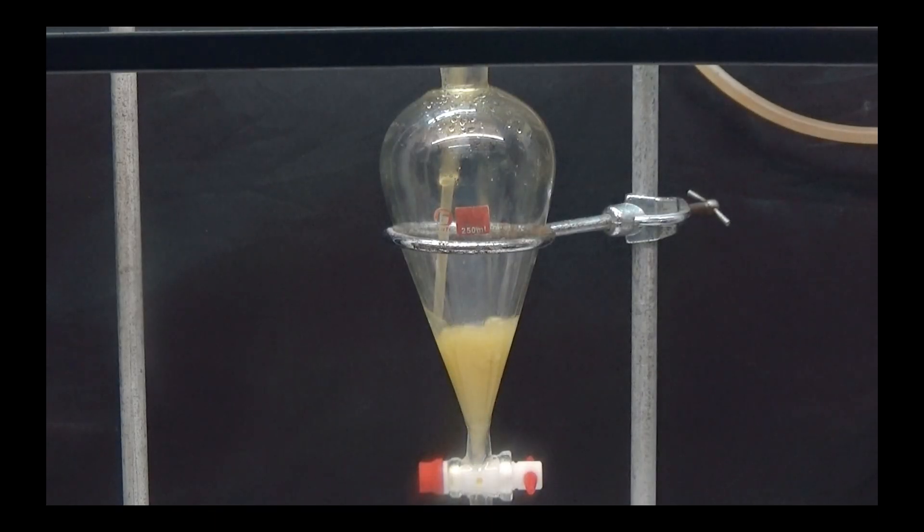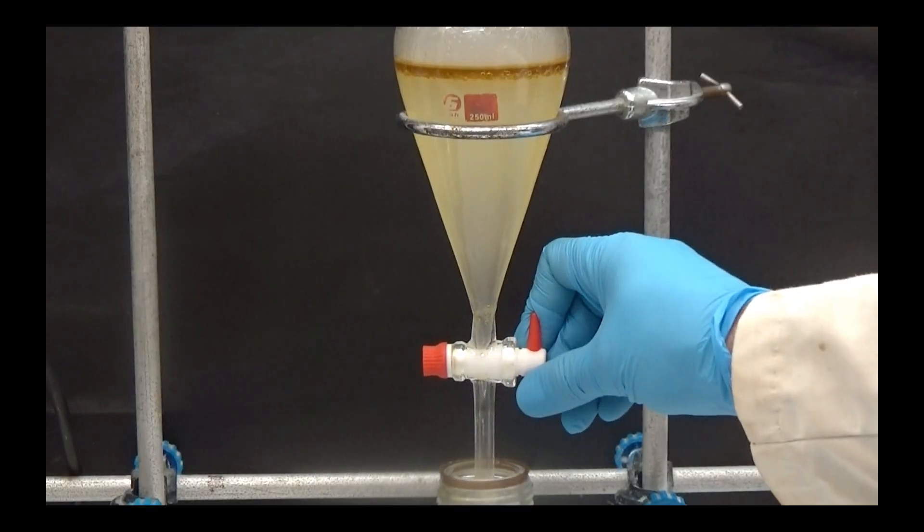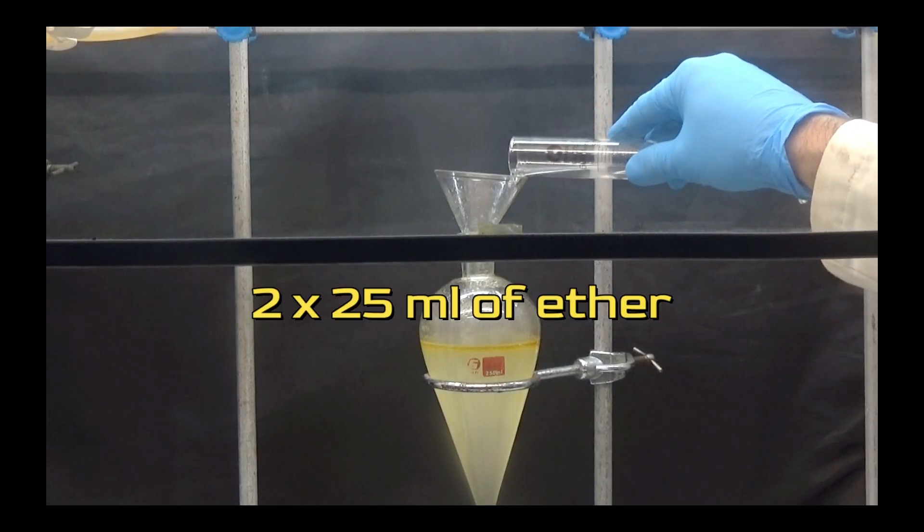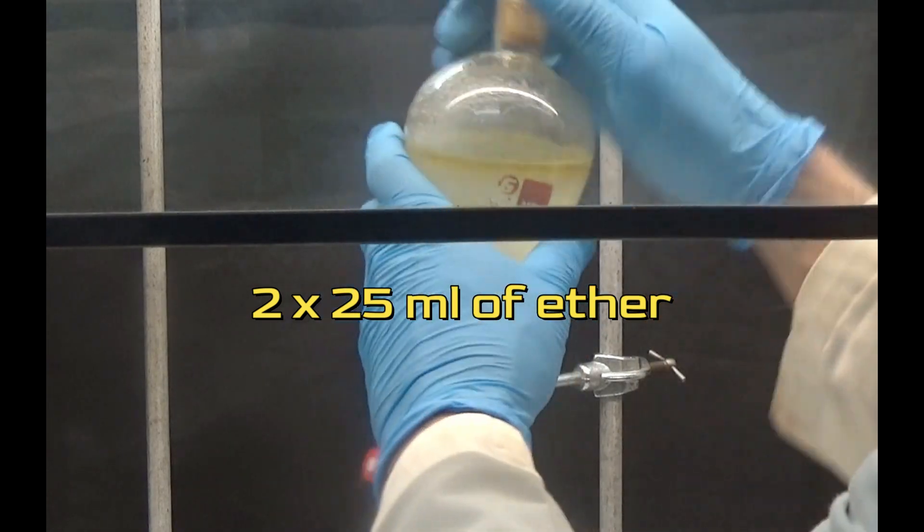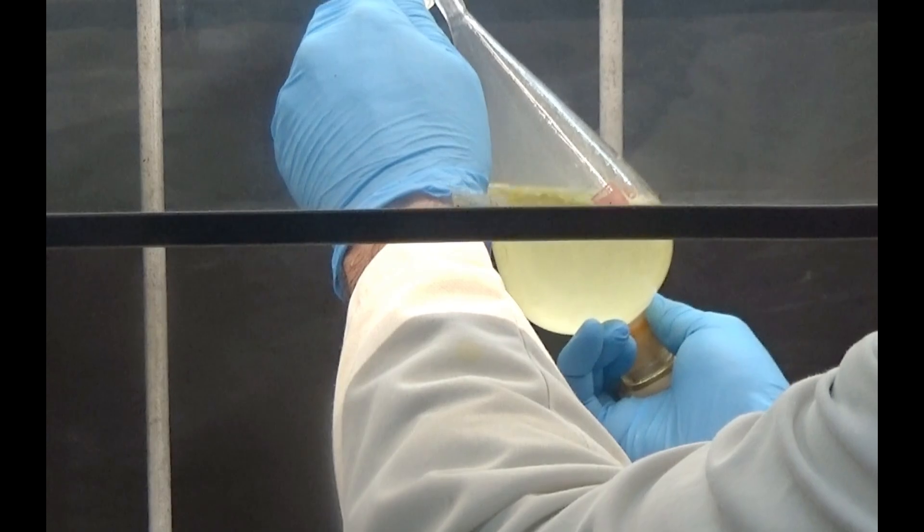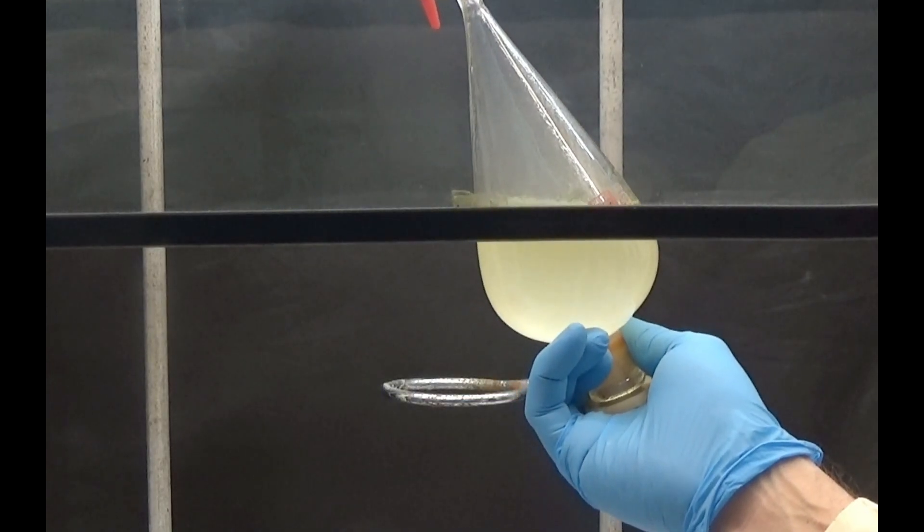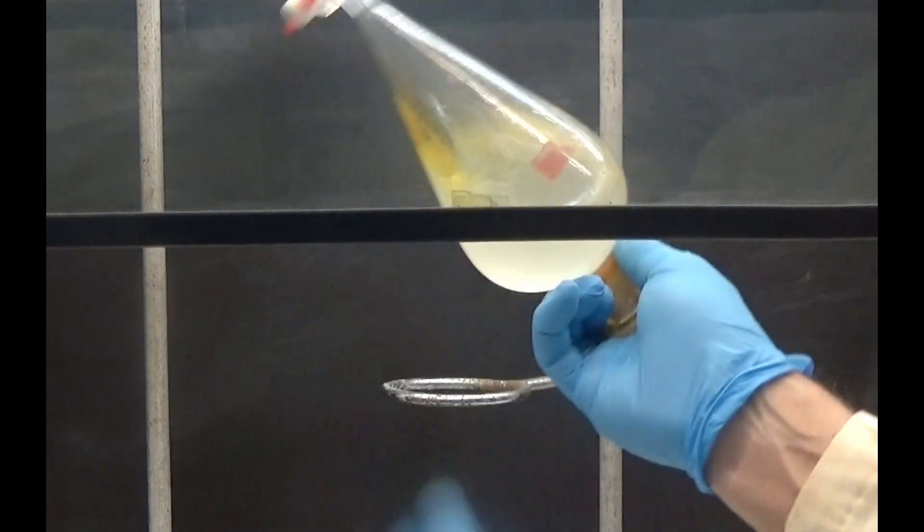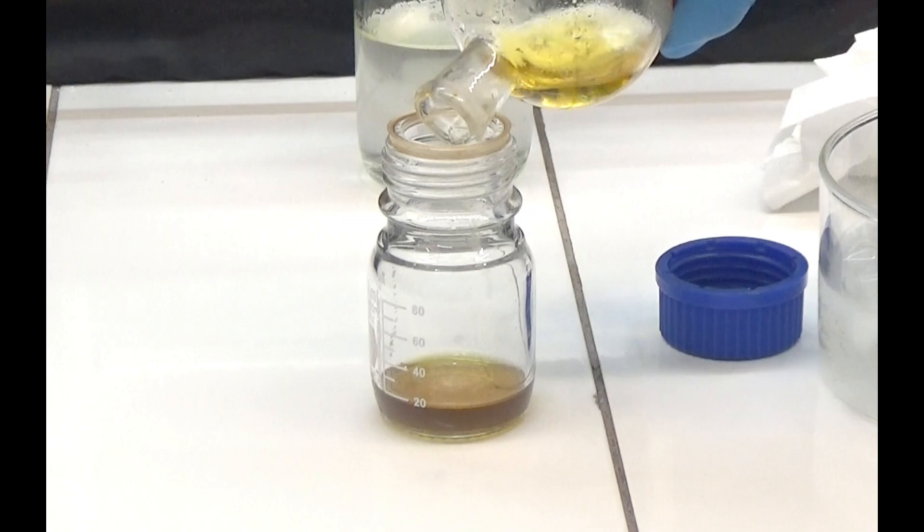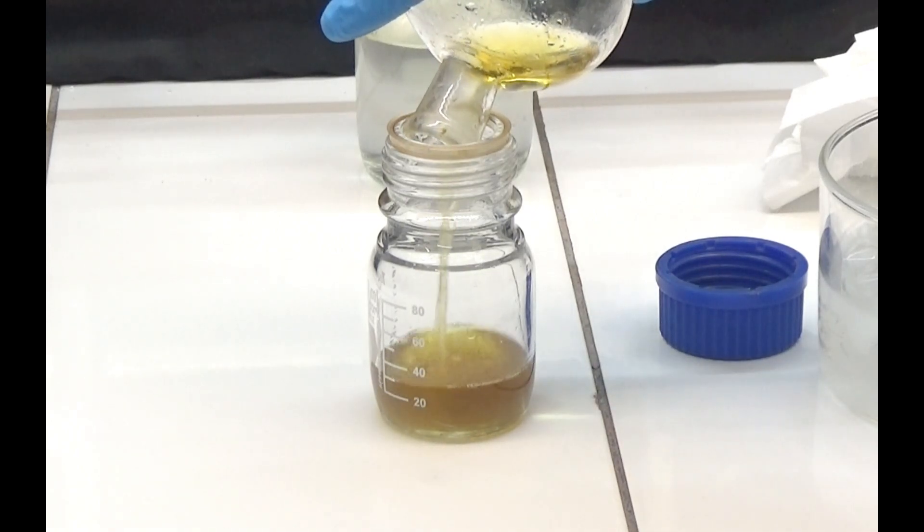Separate the aniline by using a funnel to separate the phases. We wash the aqueous phase twice with 25 milliliters of ether. We combine all the organic phases: aniline and the two ether extractions.